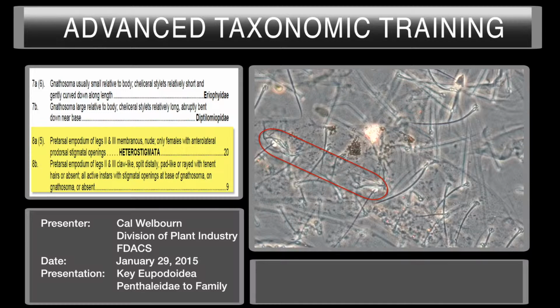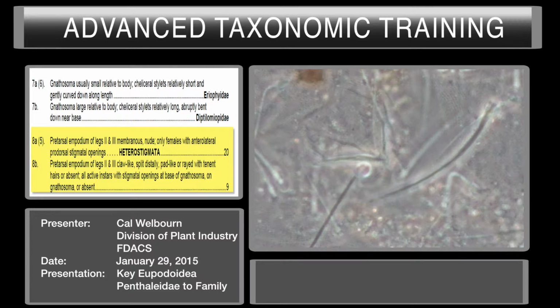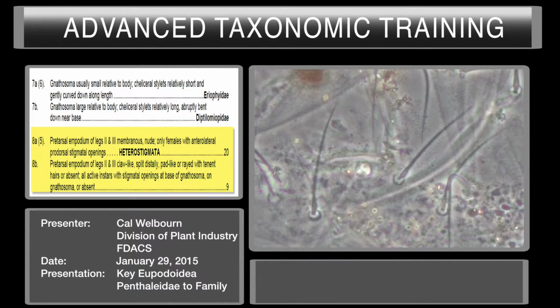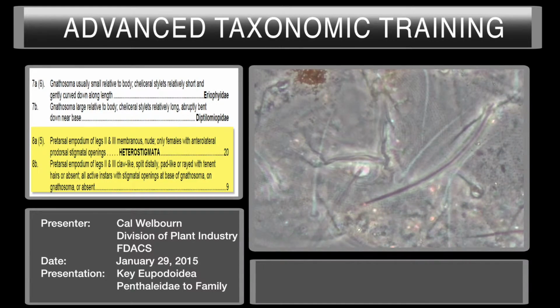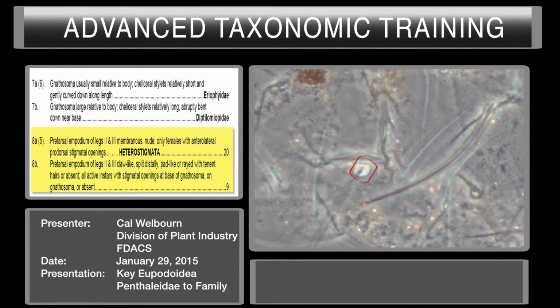These would be the SIs, the internal scapulars. One here, one there. I'm going to go back to oil so we can actually see it. Now we're on the surface of the prodorsum. Here's a seta, there's another seta here. We take this particular seta and follow it back, and we can see we're focusing down below the surface of the prodorsum. This is your bothridial base right here.